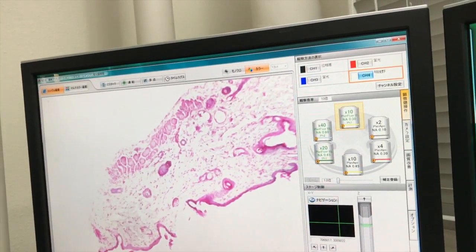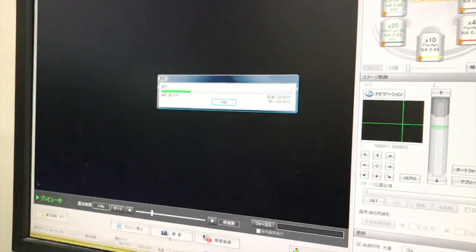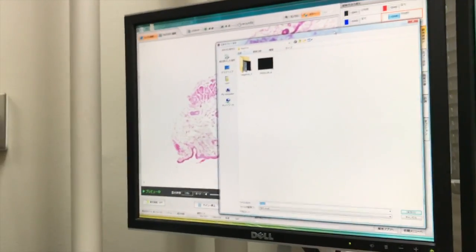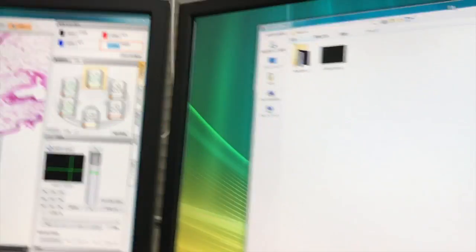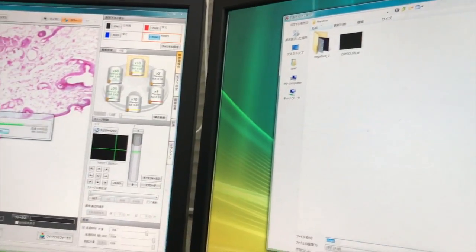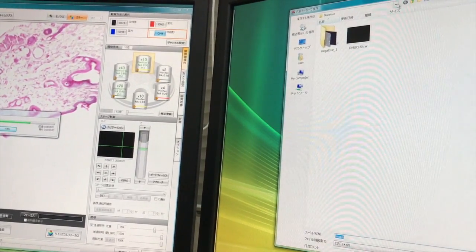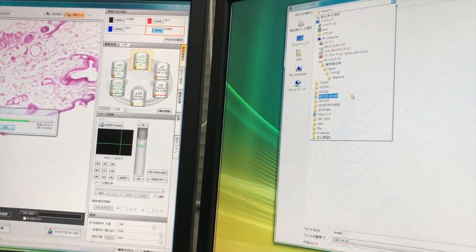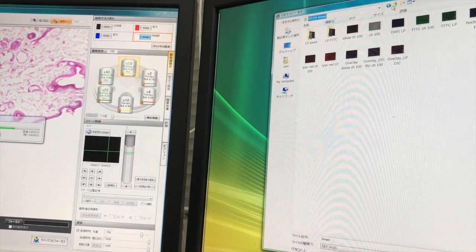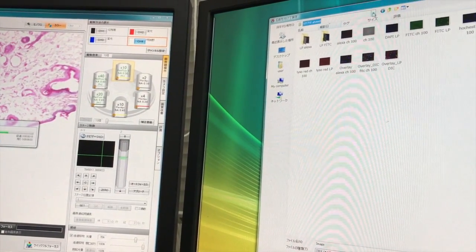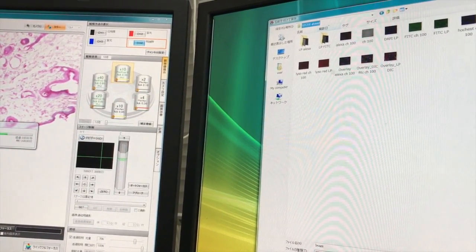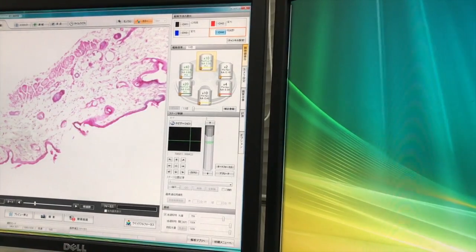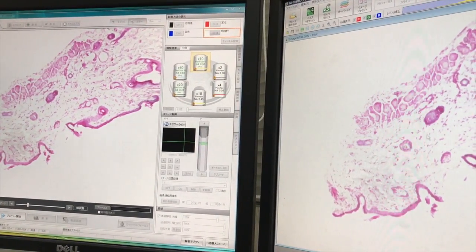If you want to save, just press this camera button. So you can move to here. You can move to here if you want. So this is... You should create a folder. You just create any folder for yourself. So this is my folder for example.